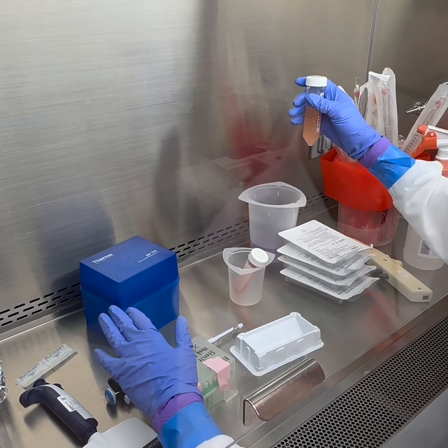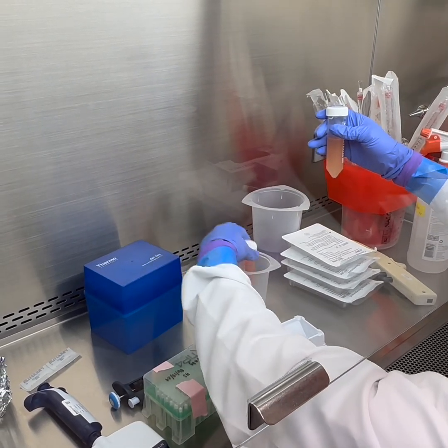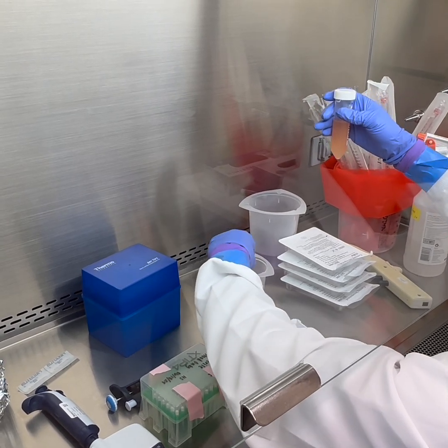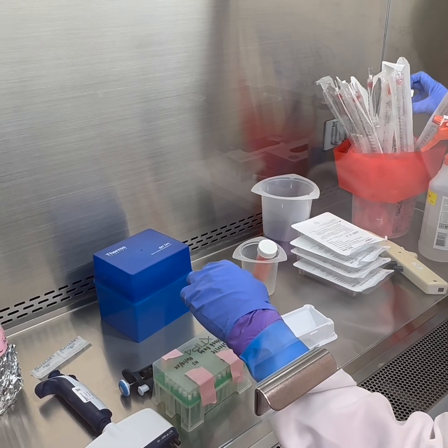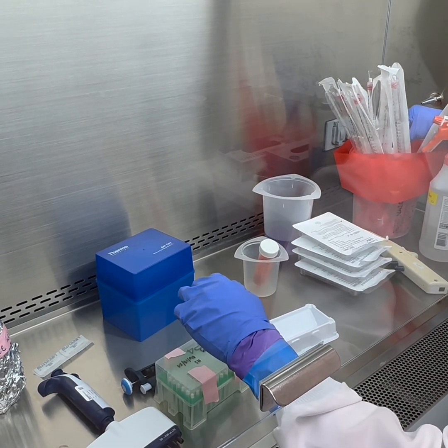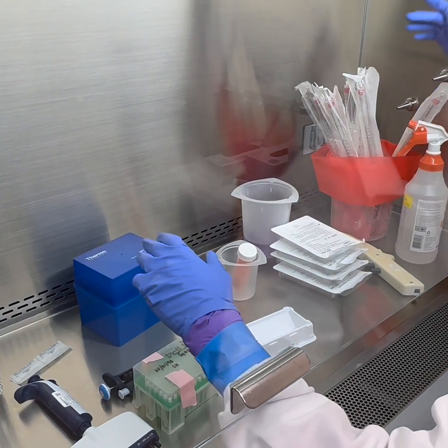So you can either pour it out into the bleach, right? This is the non-diluted. Yeah, okay. You can either pour this out into the bleach, or it's actually safer, as long as it's not going to spill, to just vent it and autoclave it. That's what we'll have you do if you don't have a whole lot of trash.